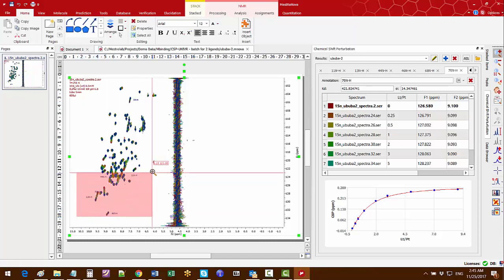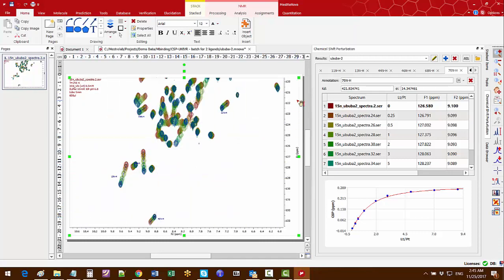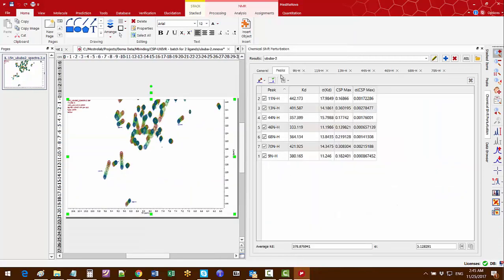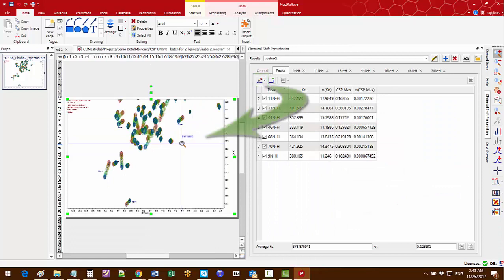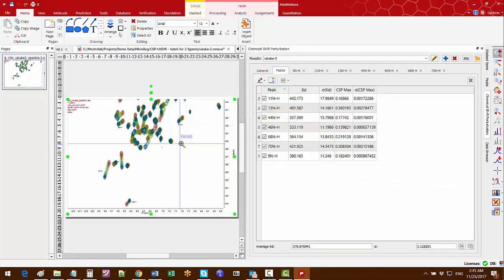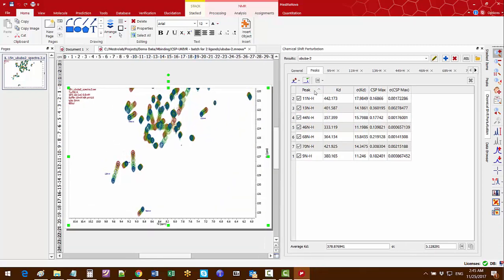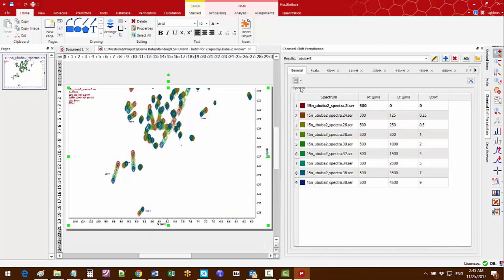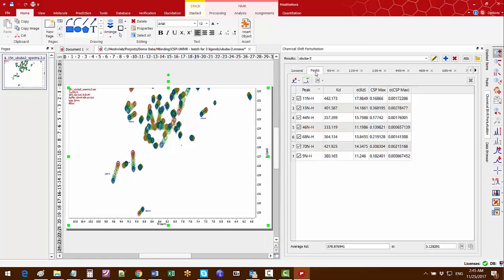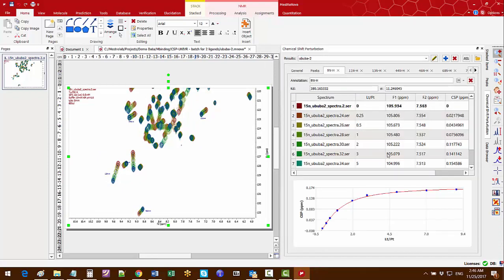In the open document, if you still want to add more test peaks, you can use the peak picking tool to add more peaks as shown in the previous video. You can report the results for all the spectra, for all the test peaks and for the individual peaks as shown in the previous videos.